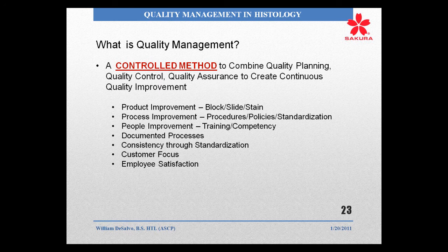So I know this was a quick overview. It's very hard to pull all of this in. There are so many different tools that can help you and lead you to success. But quality management systems are necessary. In this day and age, they're necessary. And it's also necessary for us to move forward in histology so that we can move to more automation. We have a lot of automated products, but we need more automation to help us become even better and more consistent. So again, thank you.